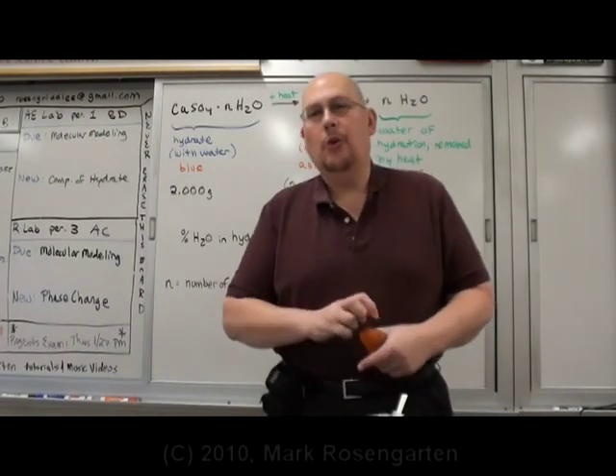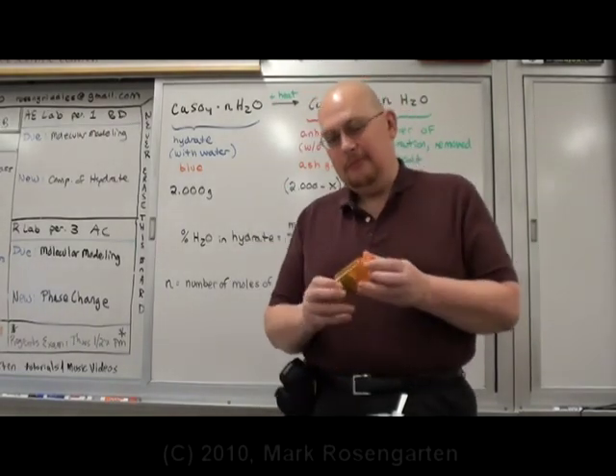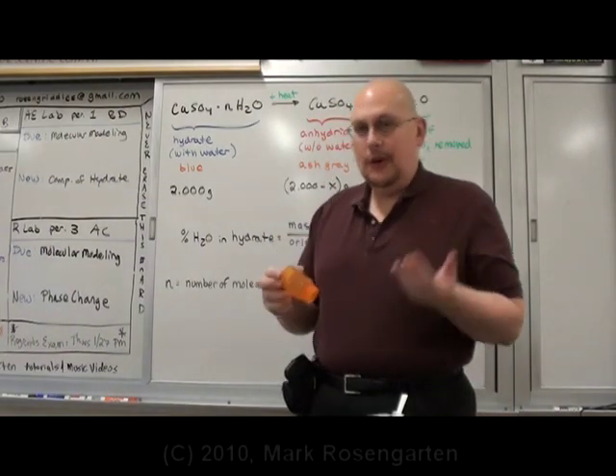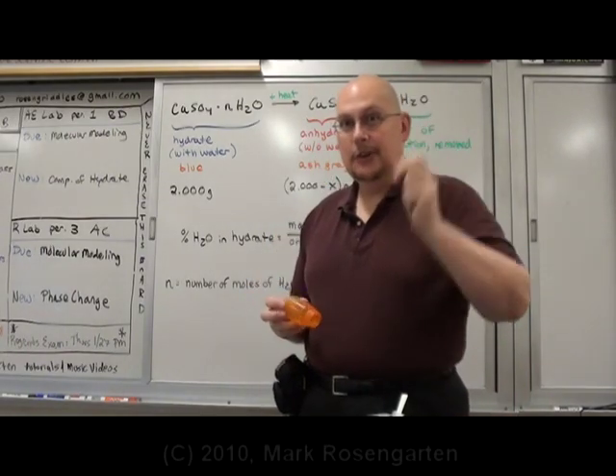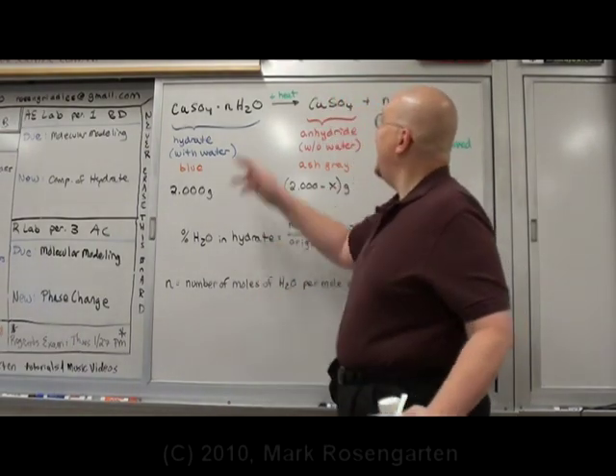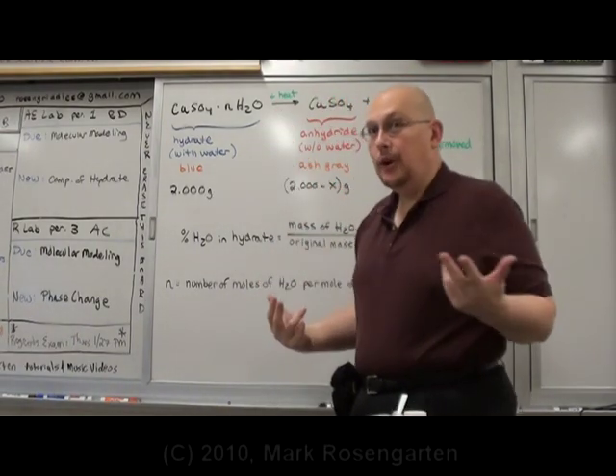A hydrate is a crystal that has water molecules trapped inside of it. For example, this is a crystal of copper sulfate. There are water molecules trapped inside the crystal structure. To find out how much water is trapped inside the crystal structure, we're going to have to add some heat, and that will drive the water out.